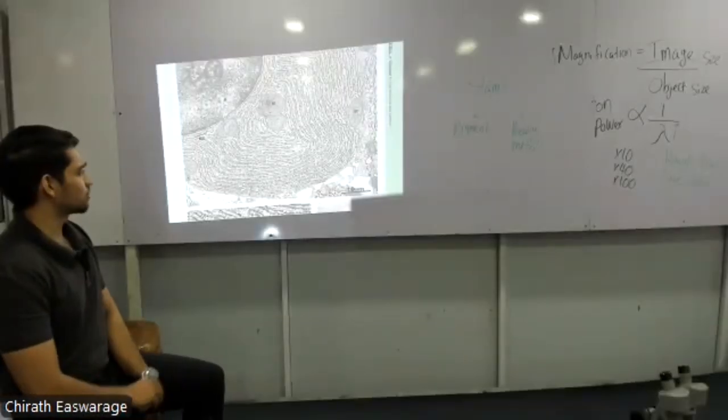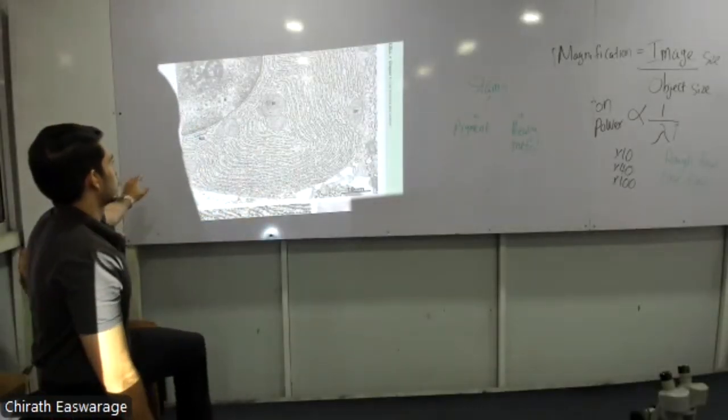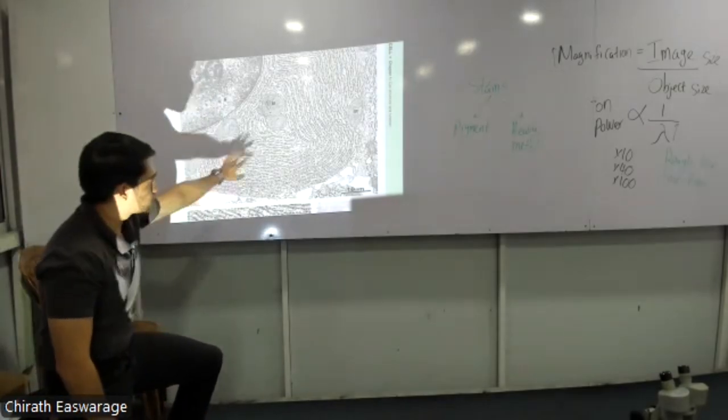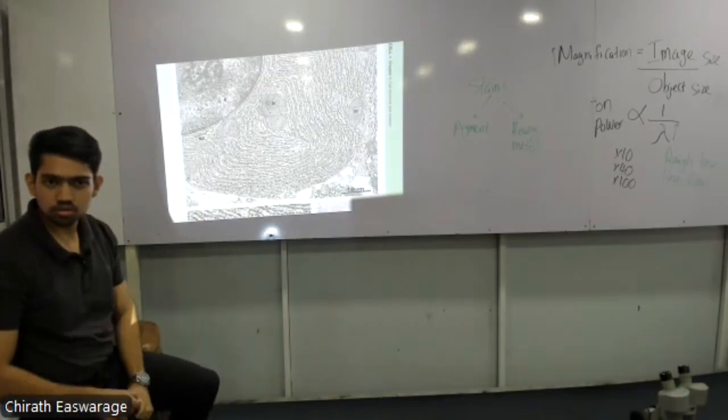So it's a massive network of membranes inside the cells. This is the nucleus, okay? That is where all the DNA is. This is the membrane network surrounding it. Have you heard of ribosomes?